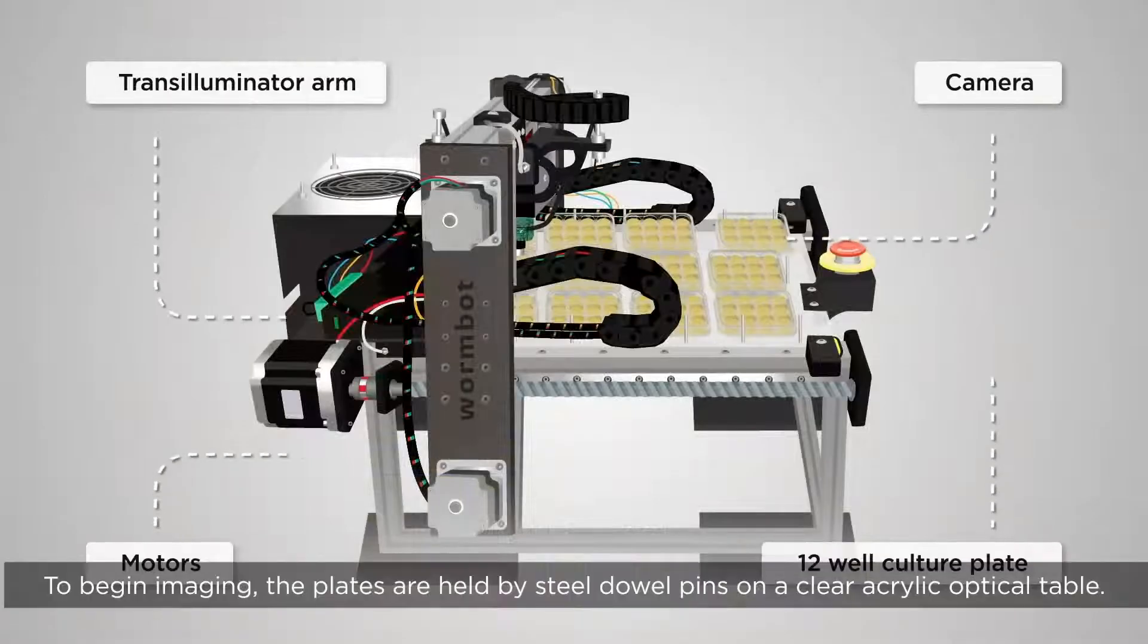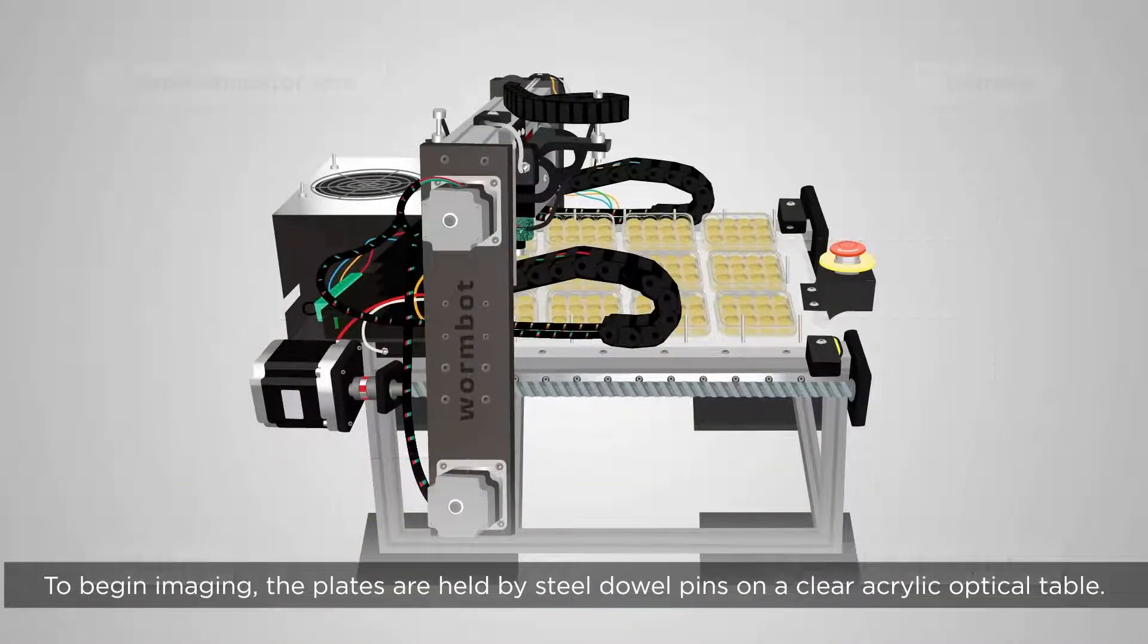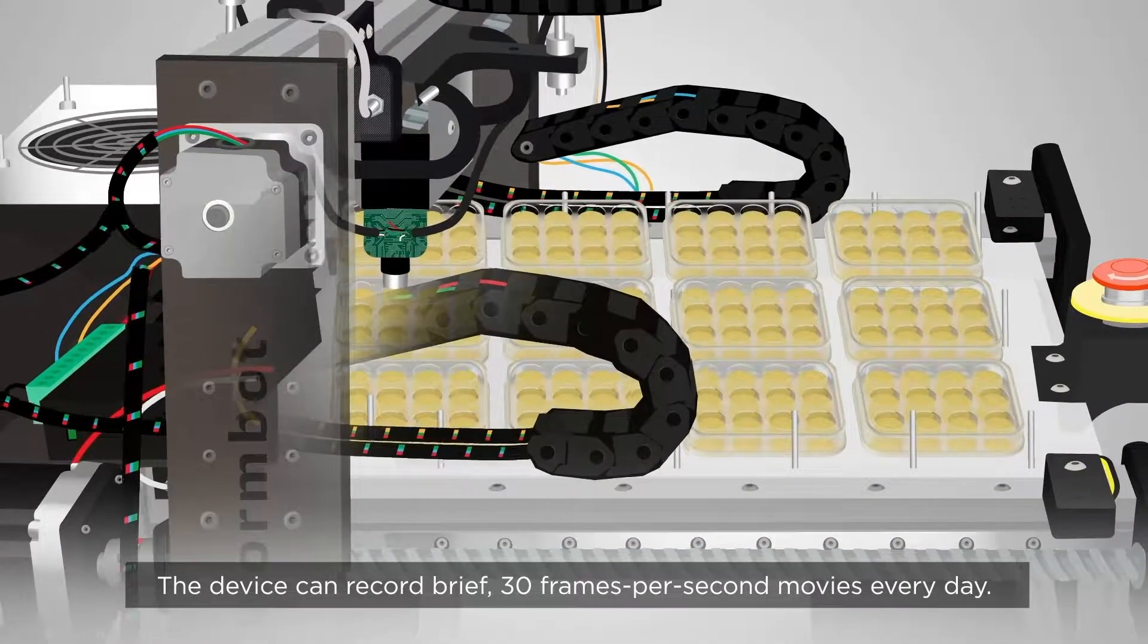To begin imaging, the plates are held by steel dowel pins on a clear acrylic optical table. The device can record brief, 30 frames per second movies every day.